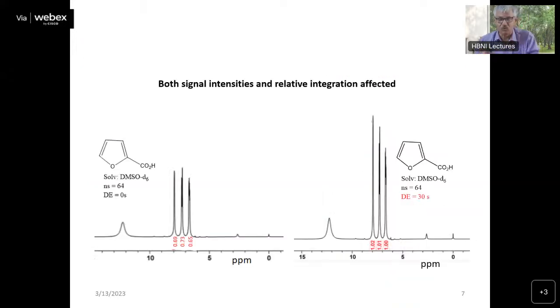Okay, so here I have shown you the effect of T1. What do you mean by T1? Depending on your T1, your delay time is fixed. If you remember, if you are using a 90-degree pulse, you have to use a 5 T1 delay between two successive pulses. That's why I told you that for this you will require about 40 seconds delay between two successive pulses.